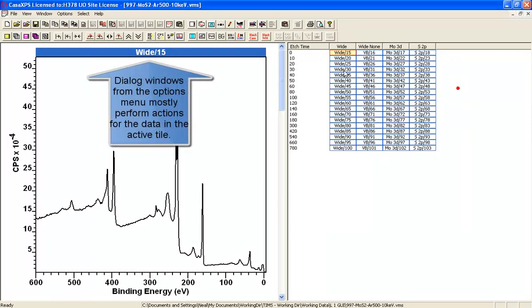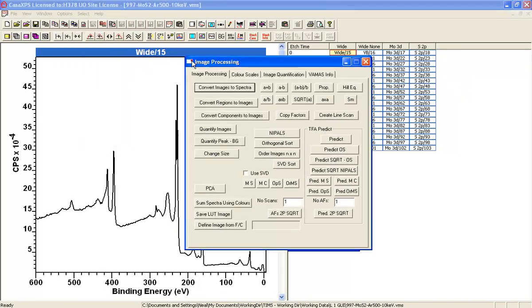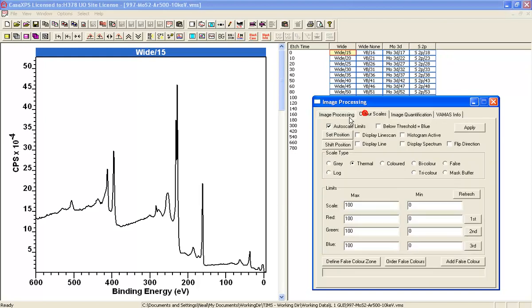Finally, on the options menu you have the image processing for when you're looking at image data. These options allow you to look at colour scales and various other image processing options.